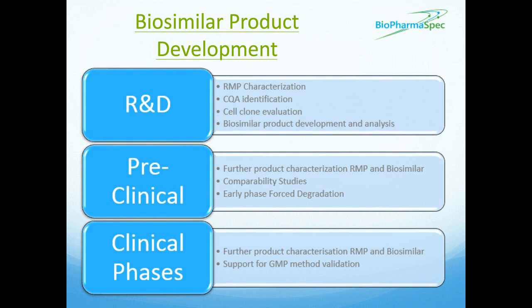One of the other areas that characterization comes in is with regard to investigations into what actually happens in the clinical trials. Quite often, how you deal with the API or the RMP in the lab when you're just taking it for a test and doing something to it before you inject it onto an HPLC or whatever is quite different from how the clinicians will actually treat the molecule before they inject it into a person.